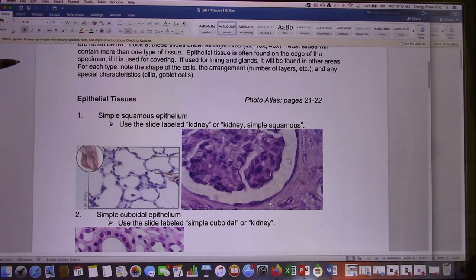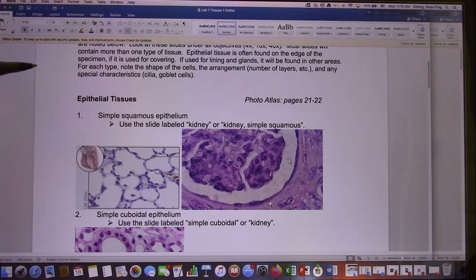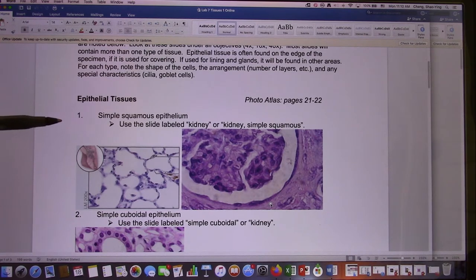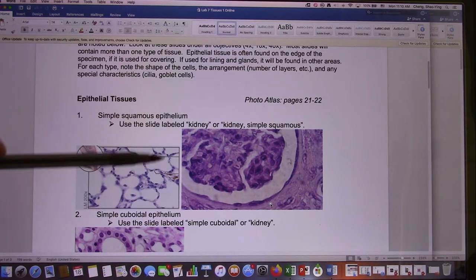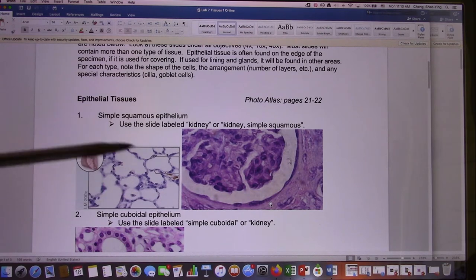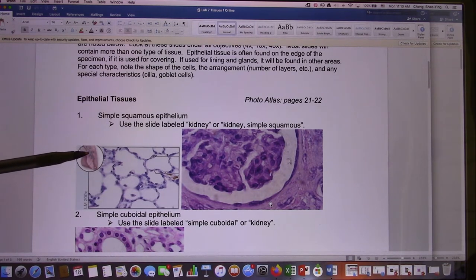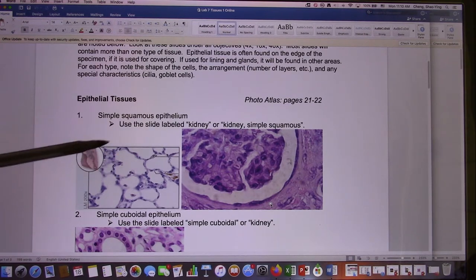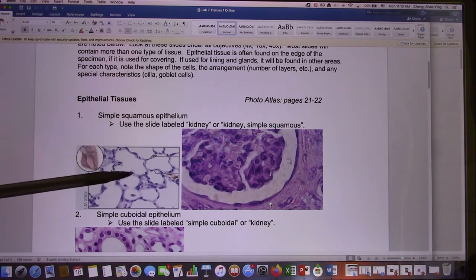So the first one is simple squamous. I use these pictures from the textbook, and during the test I will use the very textbook-style picture — the one you can easily tell. The first example is in the lung. The lung has those alveoli. These are the simple squamous epithelium tissue. This is a simple squamous.